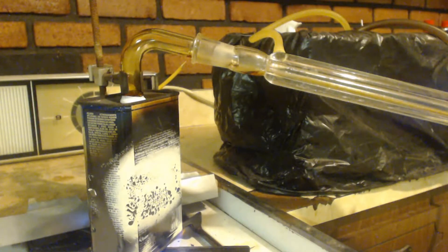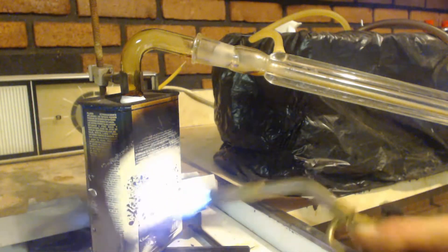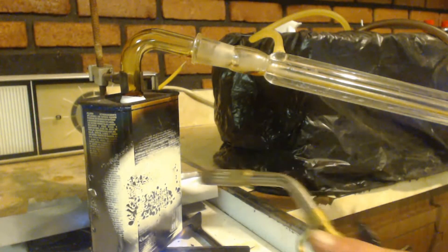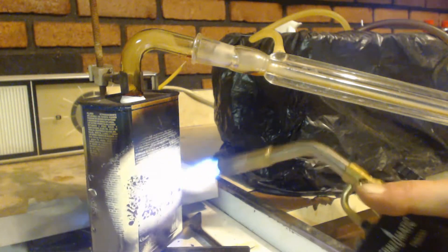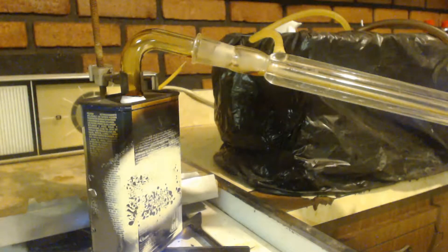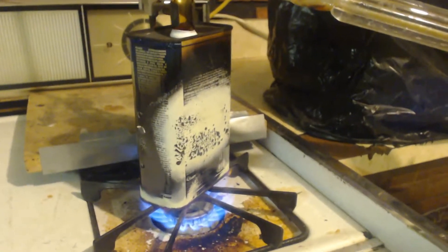We're just going to keep distilling this until it's done distilling or it blows up. Even though I know I'm going to get a terrible yield because of this, I'm just getting too scared. I'm too old. This is a terrible tin can — it's not made for this. That's my yield. I got a 25 milliliter flask, so I'm going to guess that's like 10 milliliters.